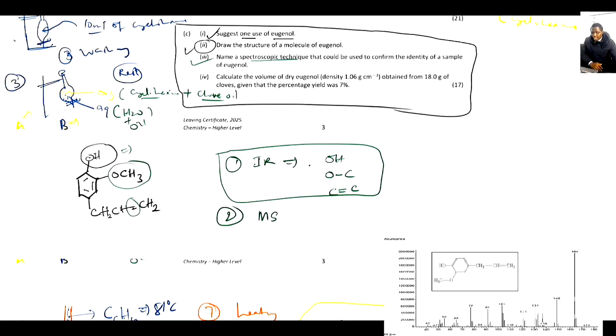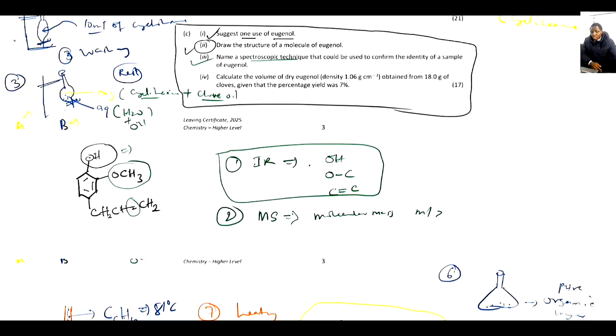This one helps you to identify the molecular mass. When you calculate this, do we have the molecular mass? M/Z. This one measures the M/Z. So that's what it does. Do we have that kind of molecular mass when we analyze the compound under MS, mass spectrometry?